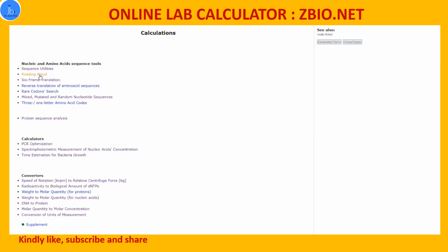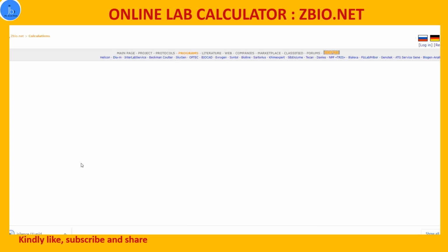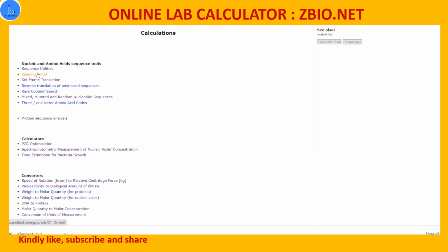Many a time you are handling a lot of samples and you have to read them aloud because we have to write them down. So you can paste them here and read them aloud, because sometimes we are manually designing the primer, or maybe we are getting ideas about where the deletion and addition are. Then you can read your oligonucleotide strands over here.